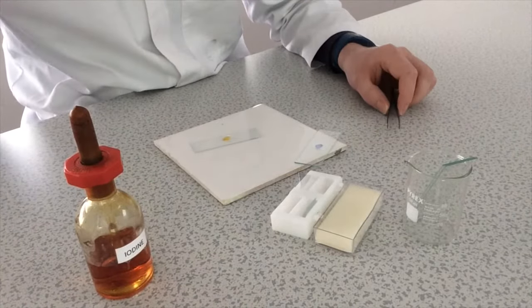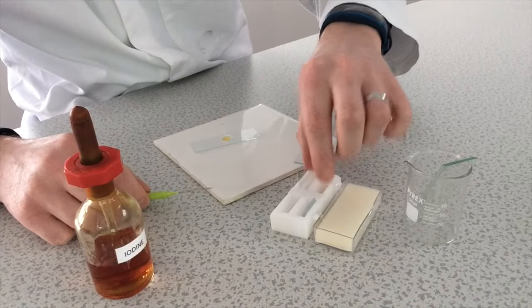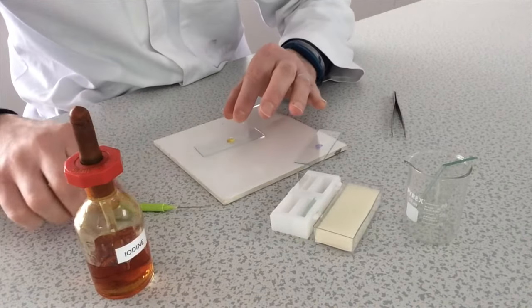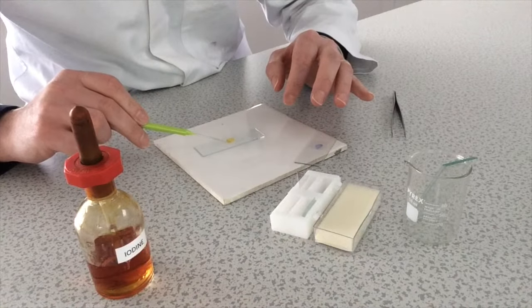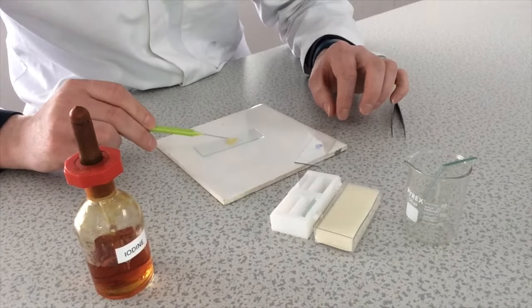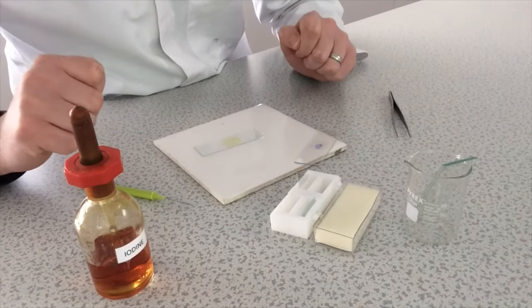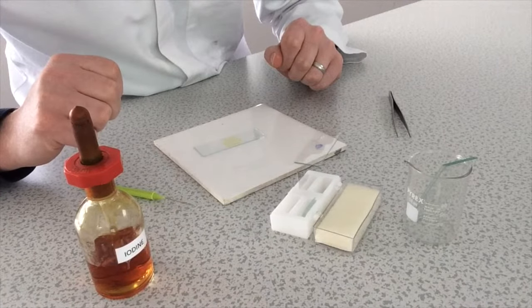And now using a mounted needle again I'm going to carefully add the cover slip nice and slowly to avoid any air bubbles. Perfect. And now my plant cell, onion cell slide is also ready for viewing underneath the microscope.